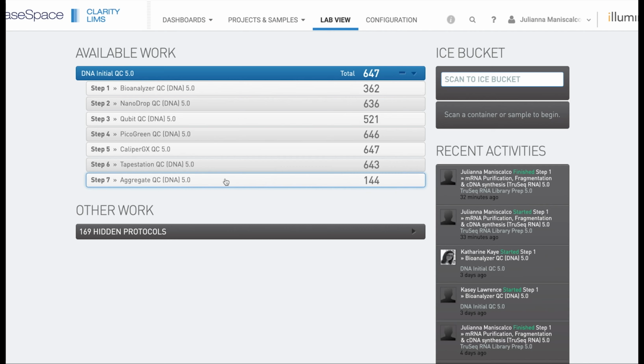However, sometimes there is logic in the order that a sample should be run through a QC protocol. In order to utilize the functionality of a QC protocol and give some order, QC filters can be used to filter out samples from a queue based on different and/or statements. From what I just said, being that the samples are assigned to every step in the QC protocol, you would expect the number of samples in each queue to be the same.